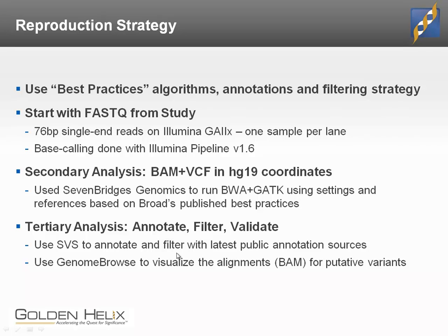We're going to use it as an annotation and filtering tool, do some visualization on it as well, but it's going to essentially use just these standard public annotations and filtering practices, and it'll be very transparent how we do each step.